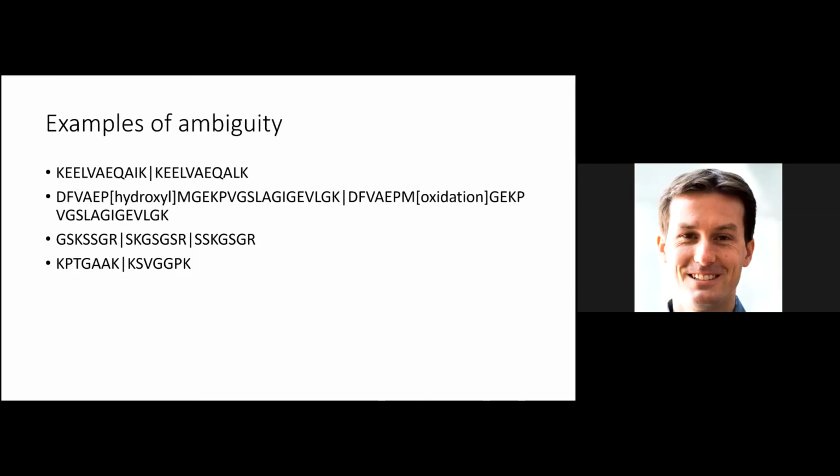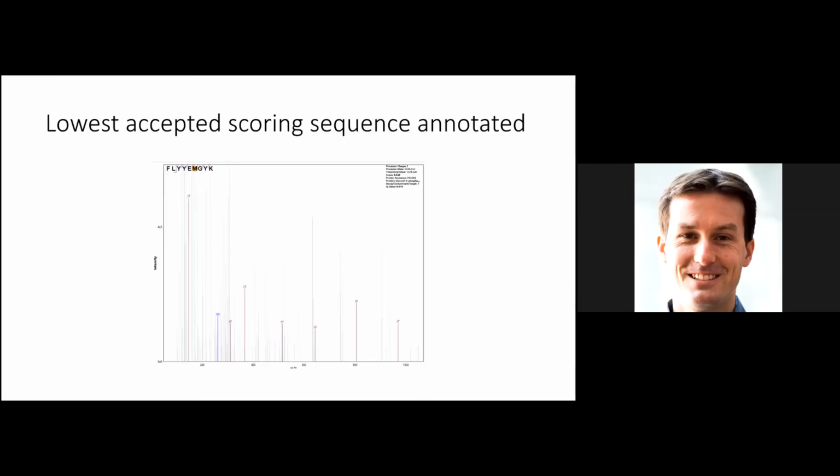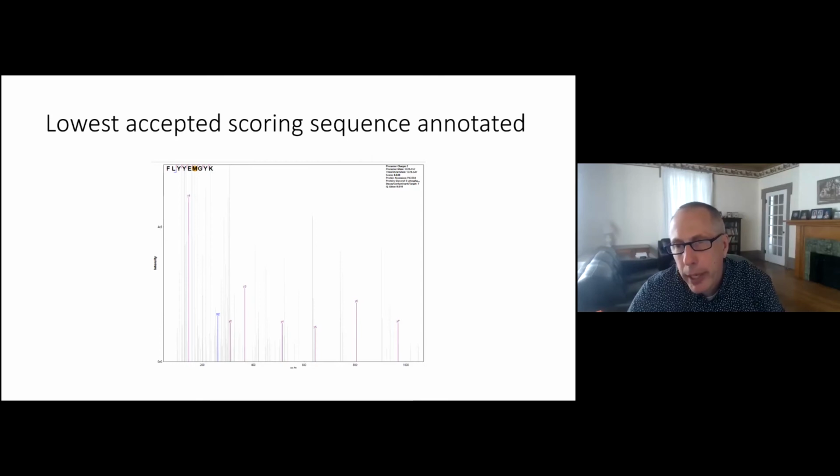So to clarify, each spectrum can be used for multiple peptide matches. Yes, absolutely. If you look at the output and the scan number, you could make a histogram by scan number, or sort by scan number, and then you would easily see cases where this was done, because the scan numbers will match.